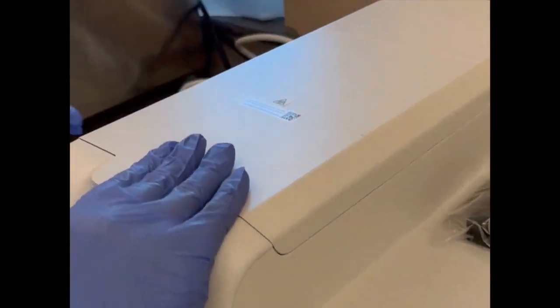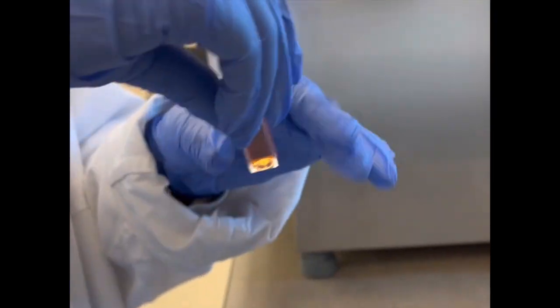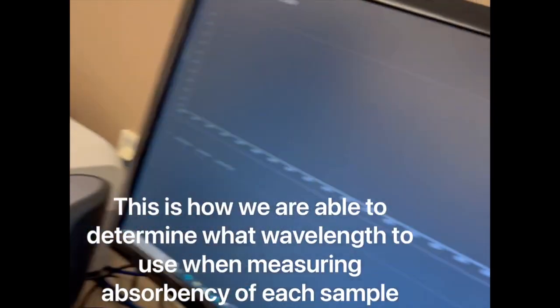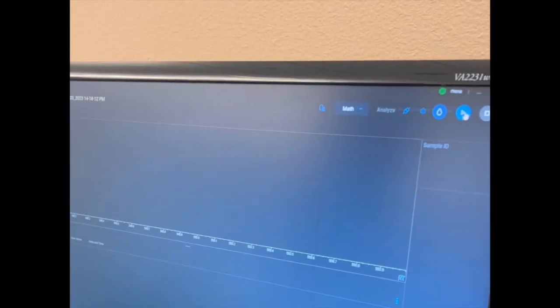Now that it has run through, we take the sample and we add our iron sample. We run it again to measure the absorbance. It has a peak absorbance at around 511 nanometers.